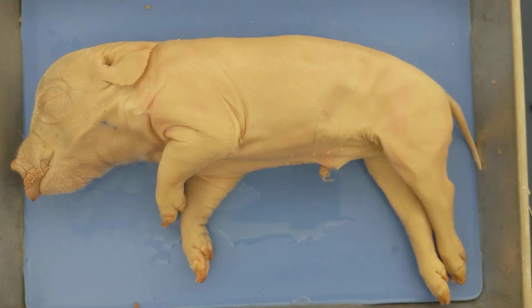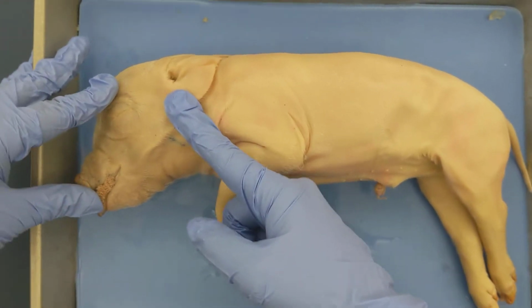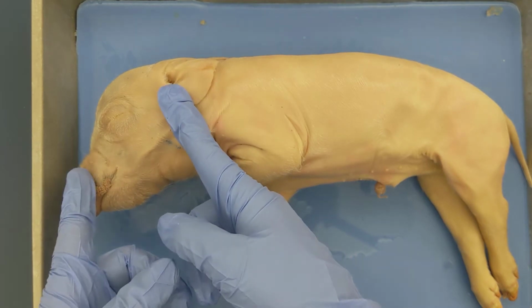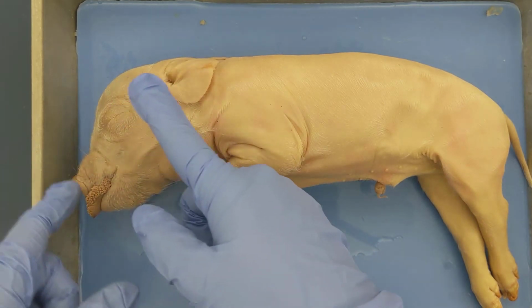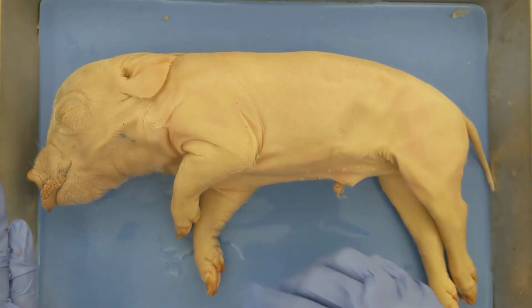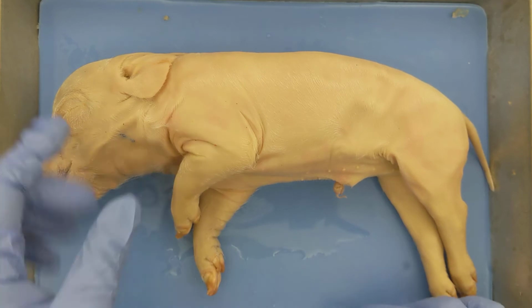Now let's talk about some of the external structures that you might see in a pig, and there are some additional external regions we'll go through first. So obviously, right here, this is our pig's head, right? And the head, like all organisms that are cephalized, has a concentration of nervous tissue in a brain region here. They also have a number of sensory organs associated with the head, like we see with a number of cephalized animals. So pigs, and actually all mammals, us as humans, we're all cephalized.